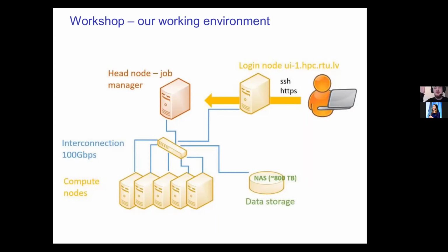First of all, the data is often stored on the server because one, it takes up a lot of space, and two, there's the data privacy protection, so you can't really put it on your personal computer. But also the servers and the HPCs are infinitely times more powerful than your personal computer, so it's just very convenient to do it there.